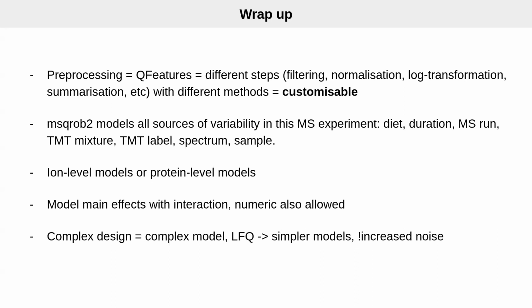For instance, with LFQ, you don't have a label, you don't have a mixture because you don't mix samples together. You actually can't include a run effect because if you have no label, basically one sample is one run, so the run effects cannot be modeled. So the model becomes much simpler, but be aware that because we do not model the run effect anymore, this can in the end get into the residual, meaning it will increase noise and decrease statistical power.